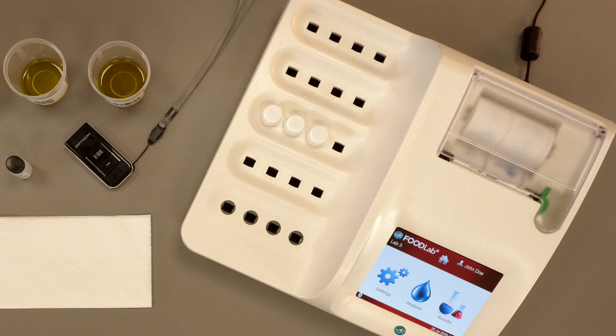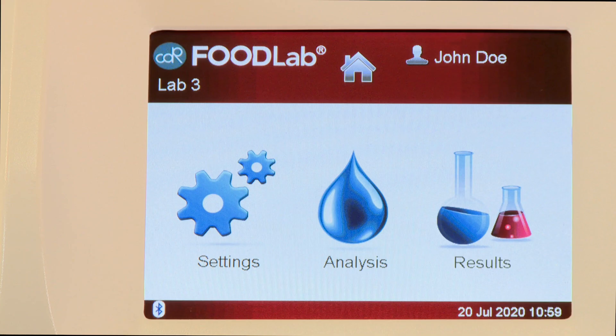In this tutorial, we will use the Opticon PX20 barcode QR code reader to store the samples to be analyzed in the Food Lab. To use the reader, the Bluetooth connection must first be activated on the Food Lab.